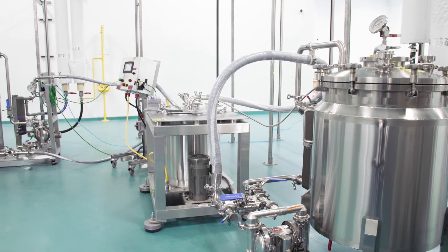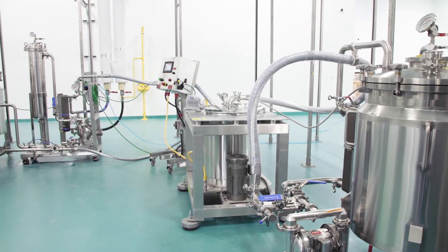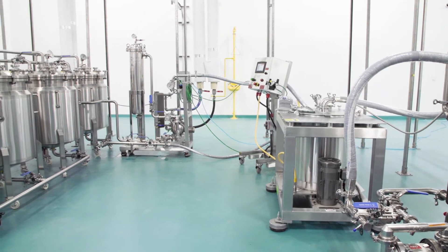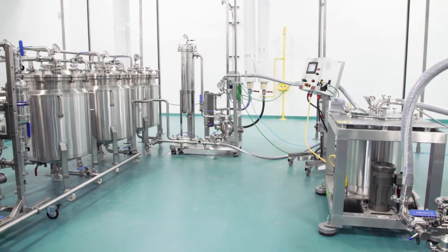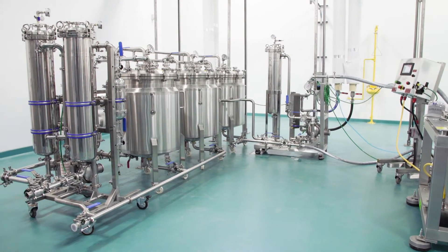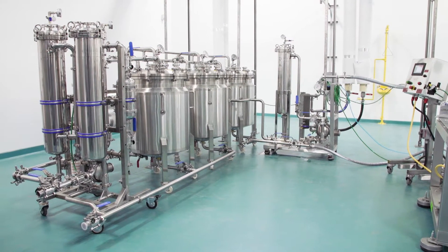The EVMASS is a series of independent process modules that can be integrated together to perform a customizable and scalable ethanol extraction process. The standard EVMASS solution consists of the following components.